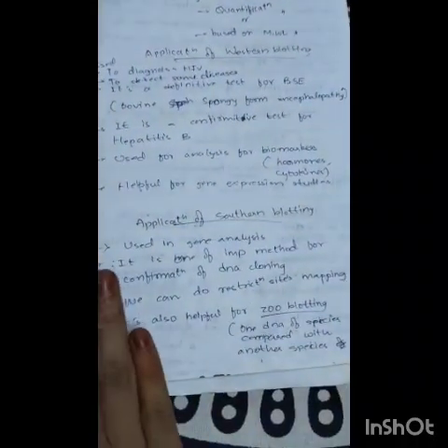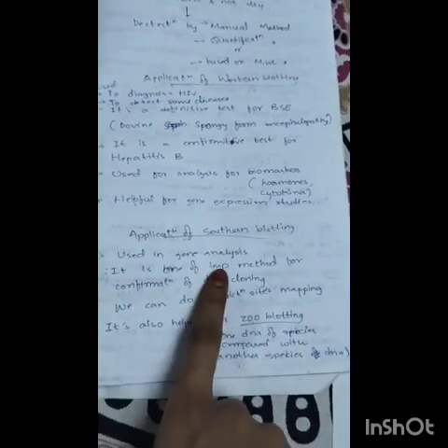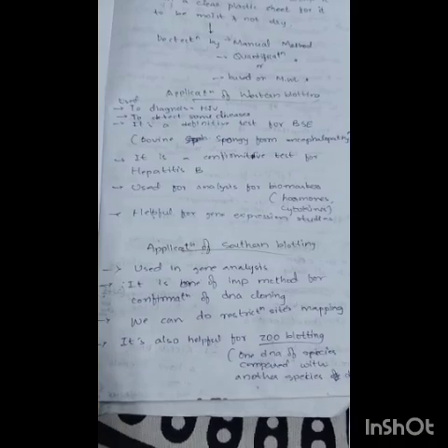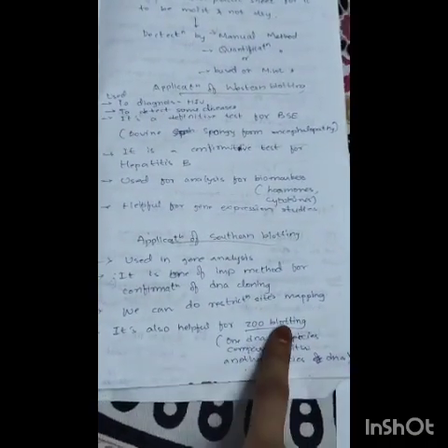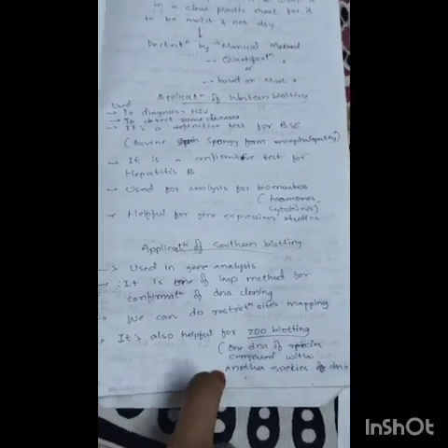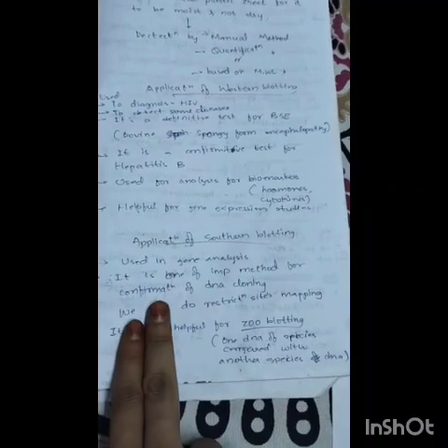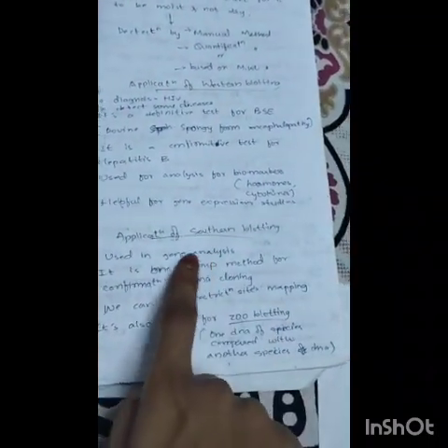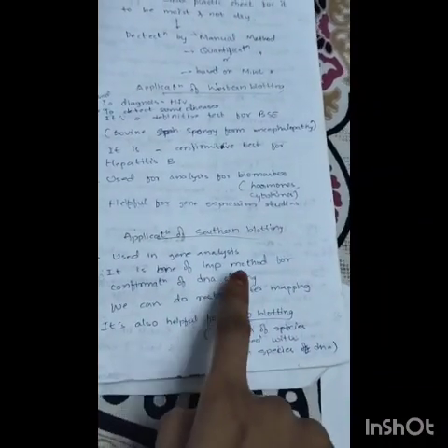Now the applications of Southern blotting. Southern blotting is used for gene analysis. It is an important method for the confirmation of DNA cloning. Restriction site mapping can also be done, and it is also helpful for zoo blotting. So these are the four applications: gene analysis, DNA cloning, restriction site mapping, and zoo blotting.